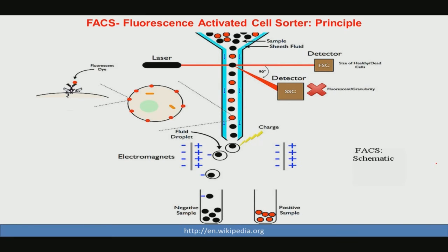Okay. One of the other techniques, which is more widely used in biomaterials research currently, is for more quantification of the different cell fate processes. These cell fate processes I have mentioned before, like cell division, cell migration, cell proliferation and so on. For this quantification, FACS analysis is used quite a lot.